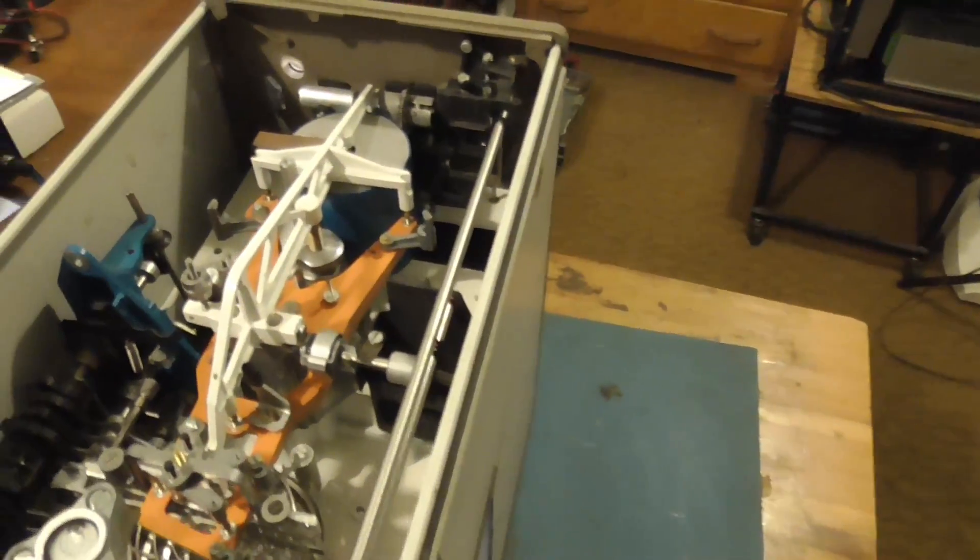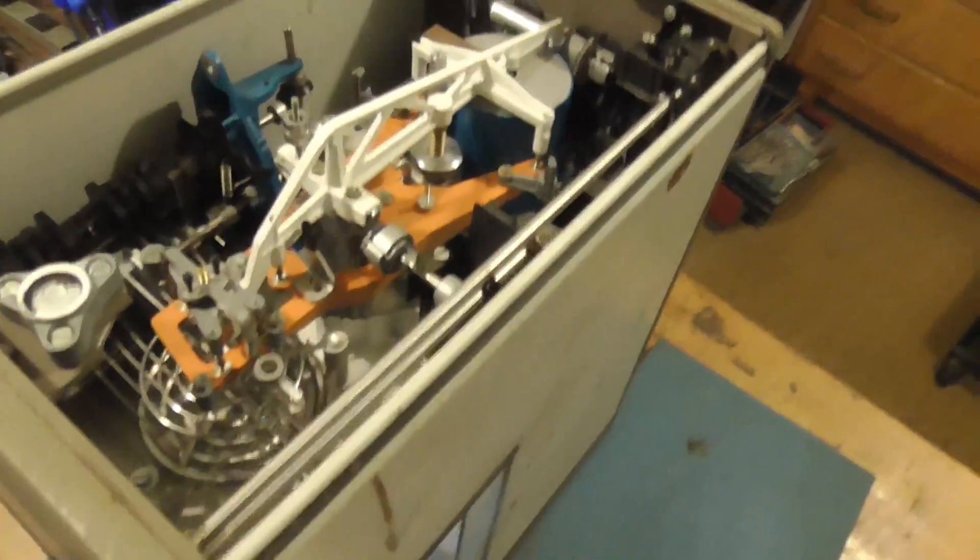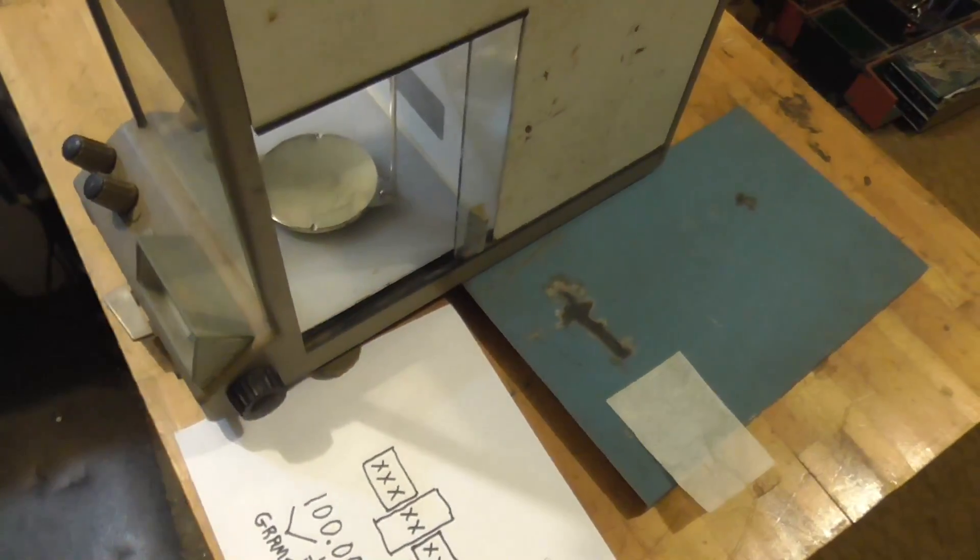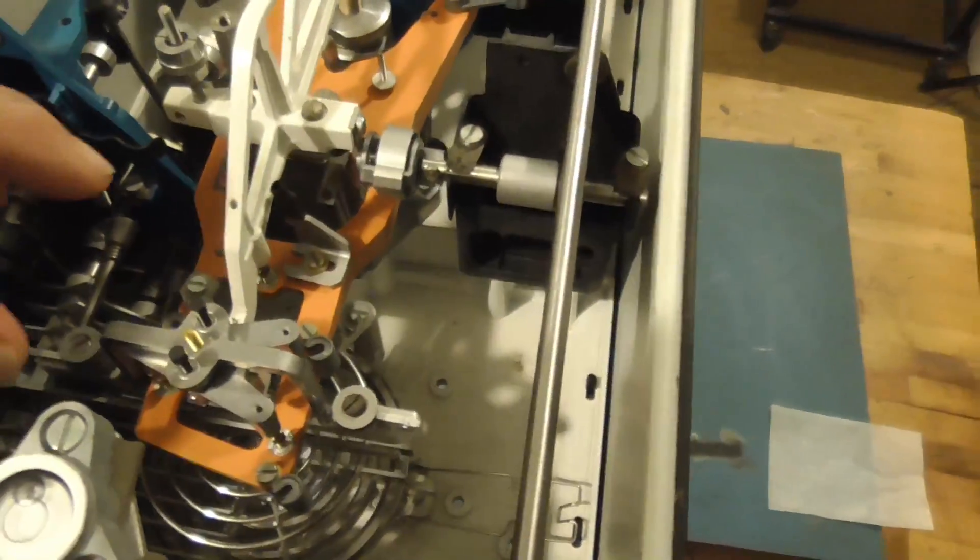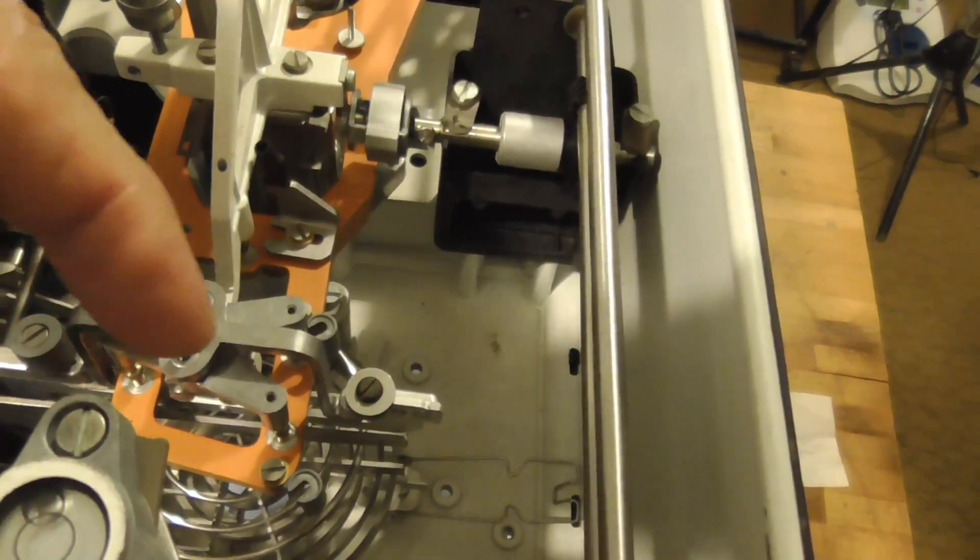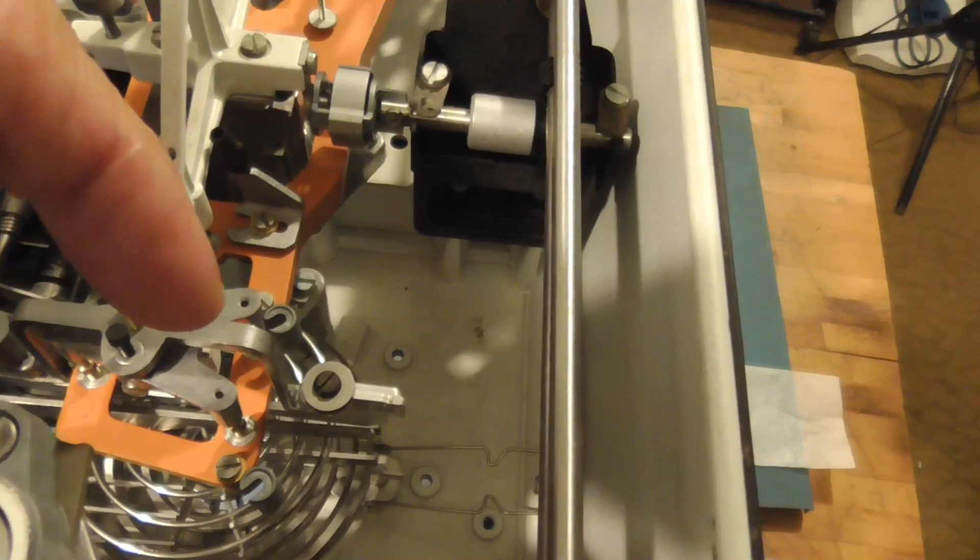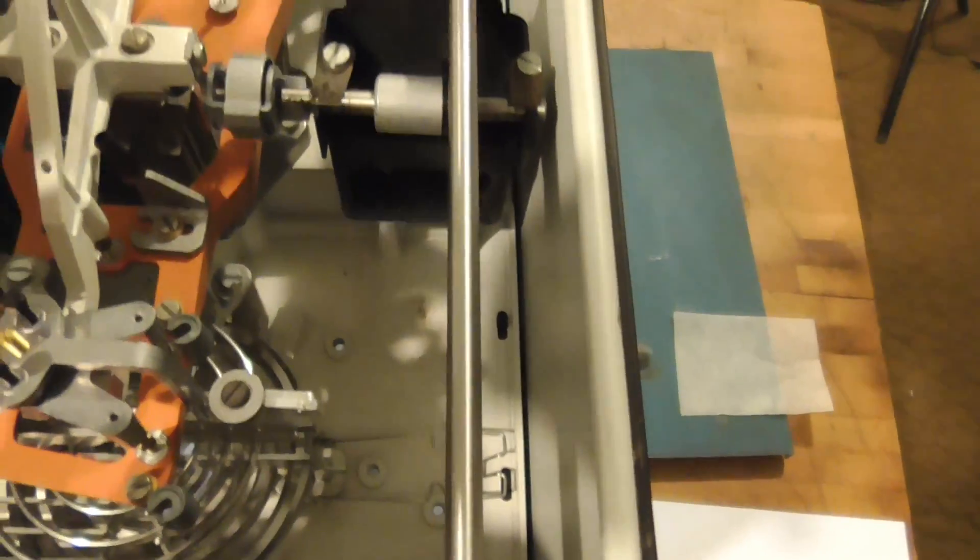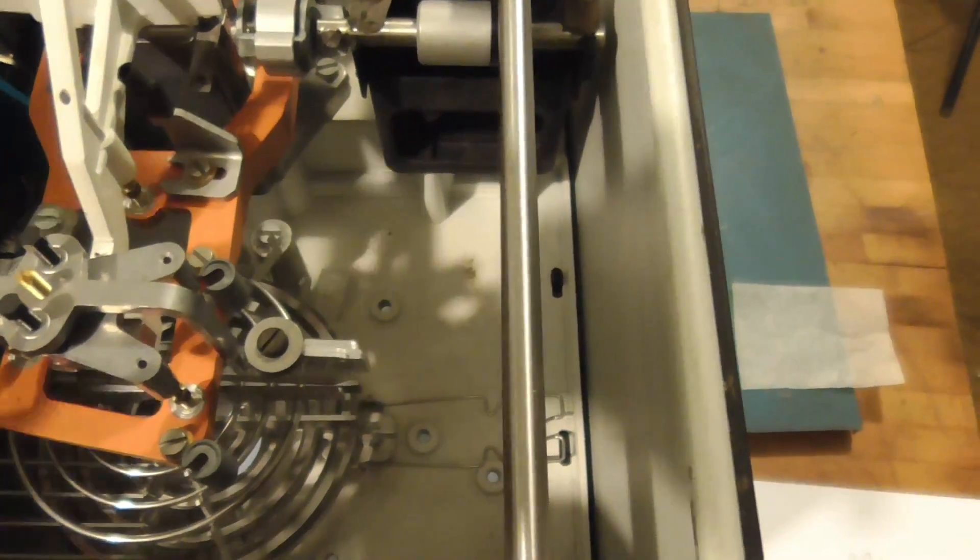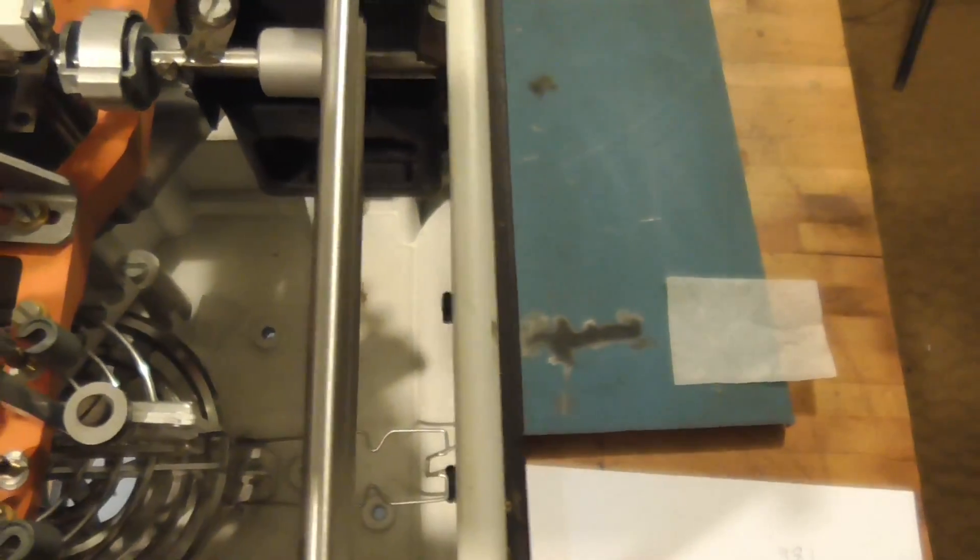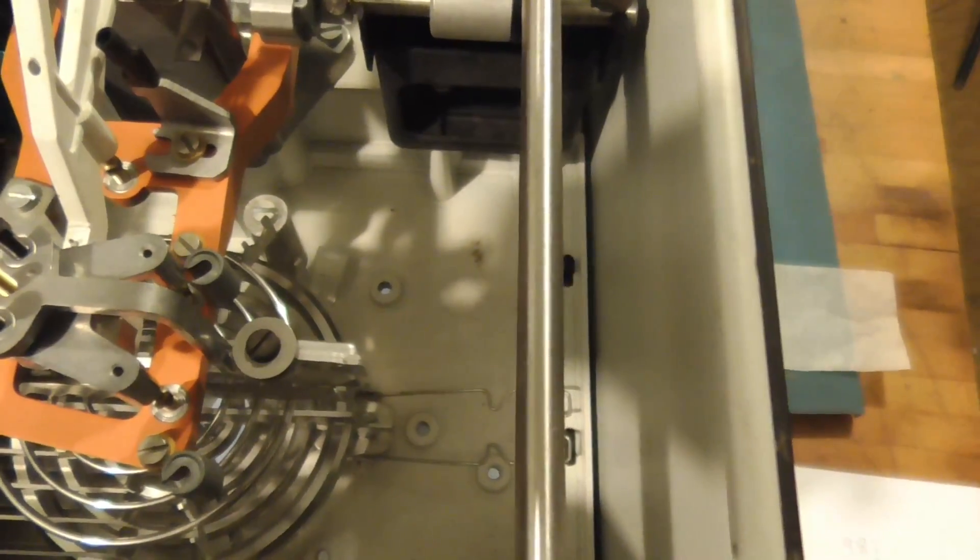I hate to throw it away. It's a beautiful piece of history. They're on eBay right now for a large amount of money. They don't realize that all of this stuff in here, it's just balanced. There's a piece of sapphire, actually. It's a little sapphire bar. And that balance is a point that is pushed down on that sapphire bar. And that provides the extremely small amount of friction that it can have to where it will change with the weight of a flea, literally.